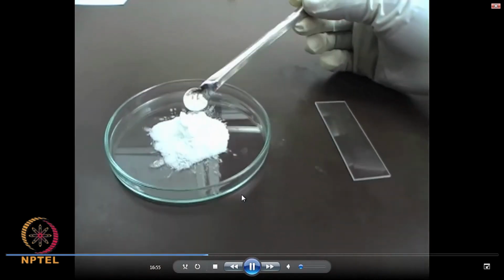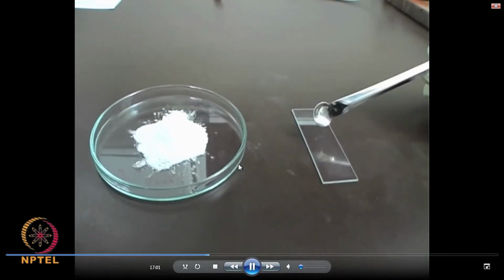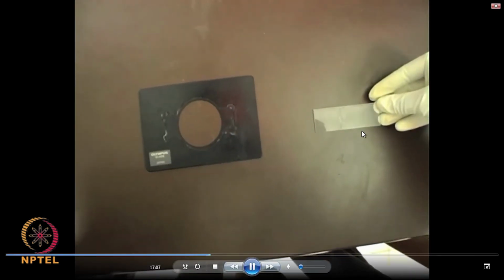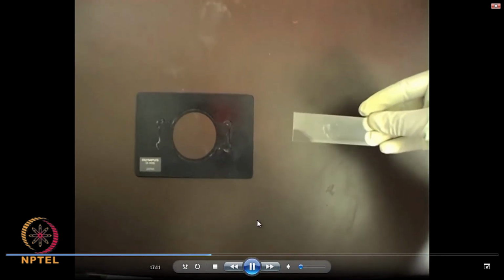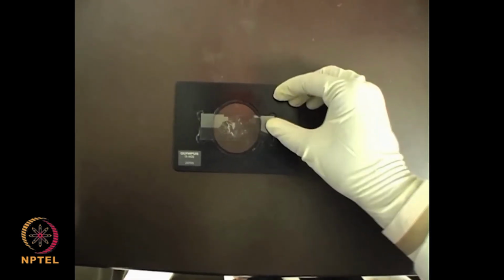Let us look at these glass microspheres in a transmission optical microscope, like I described in the last class. The specimen is taken on the glass slide in a very small quantity, and then we will load it on the microscope and look at the details.